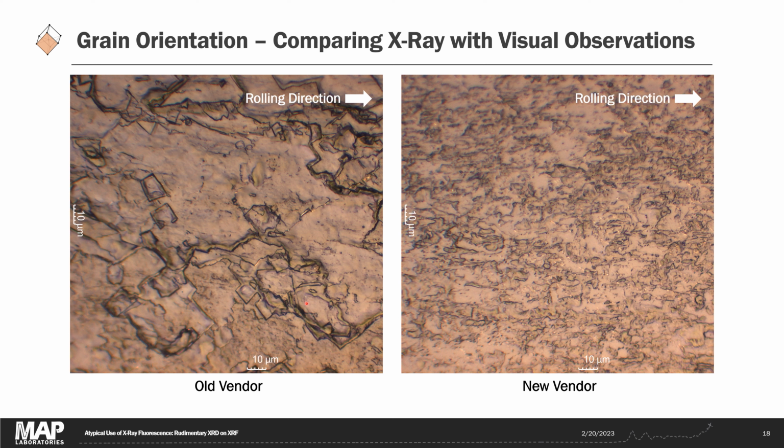Here's that same comparison, just at a little bit higher magnification, and yes, we can see that there are indeed some cubic-shaped crystal grains, their faces parallel to the specimen surface, diagonals aligned with the rolling direction. So this is really cool. This is why we saw that 200 X-ray diffraction peak in our XRF analysis. It's from these types of structures diffracting the X-rays back at the detector.